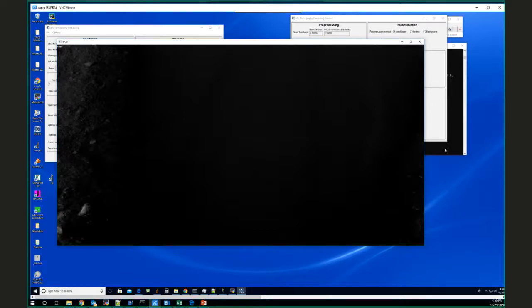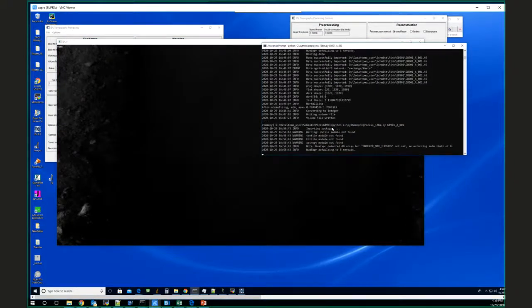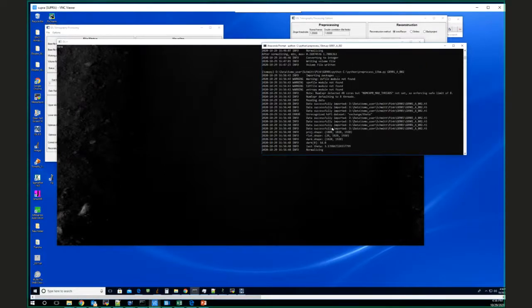If you have two places in the sample that you know are identical composition but different density, then the X-rays are good for telling that. So you think they're iron rich regardless then? I couldn't even say for sure it's iron, but it's some higher atomic number. Is that melt rich in calcium compared to the granite, which is probably richer in sodium? I don't know what the composition of that melt is, but if it's basaltic, it could have both higher iron and higher calcium than the granite.